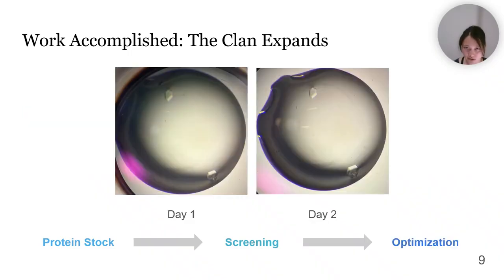To generate larger crystals, I've replicated my hit conditions in a larger drop format. Once again, on the very first day I observed crystallization, with the appearance of 2 new members of the crystal clan, Kendall and Kylie. We will continue to monitor their growth as well as fine-tune the concentration of precipitants in future experiments to see if the crystals can grow any larger.